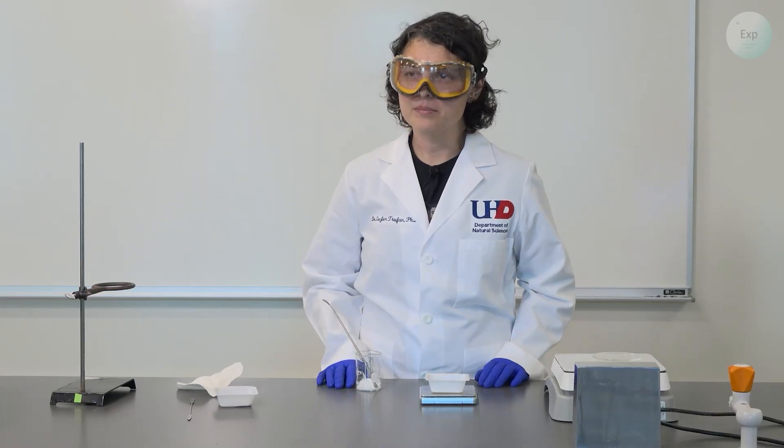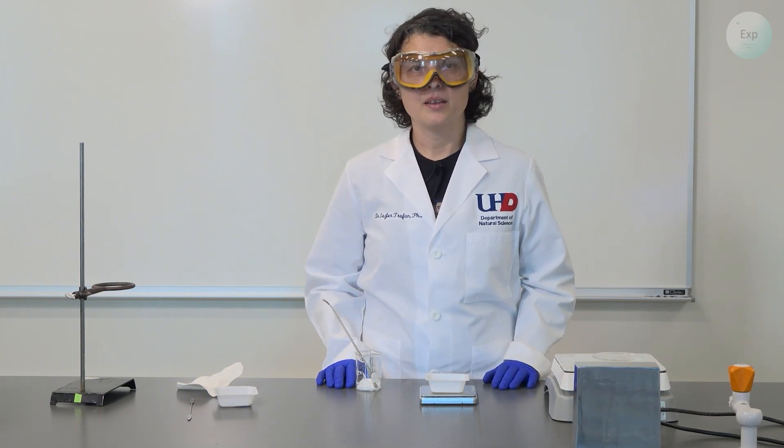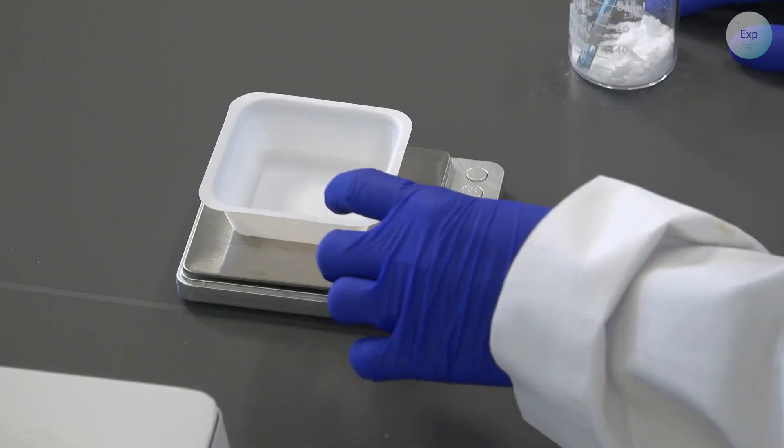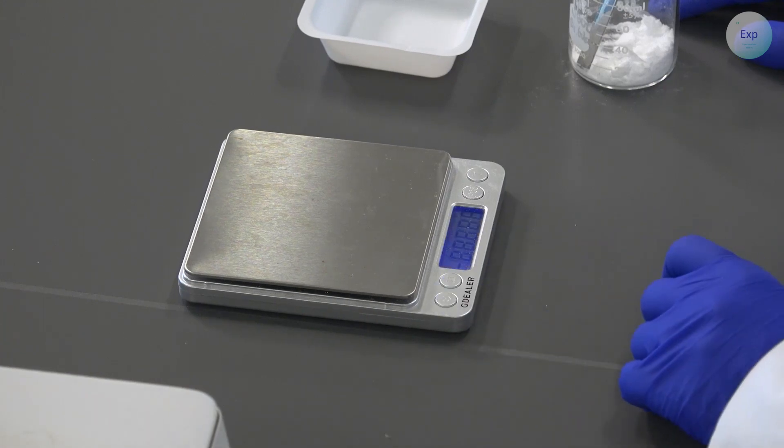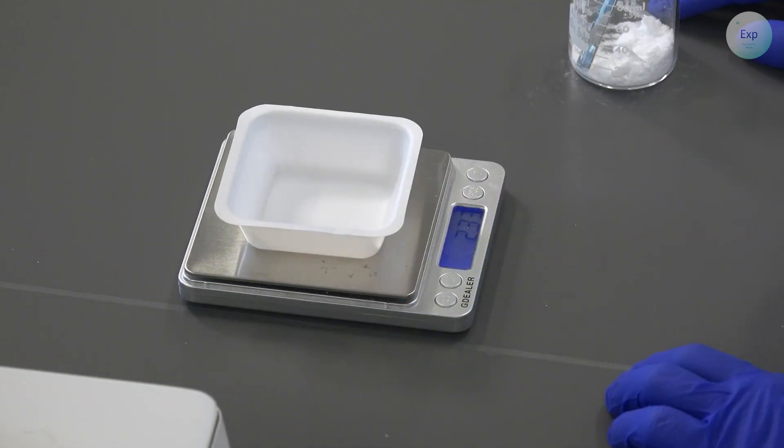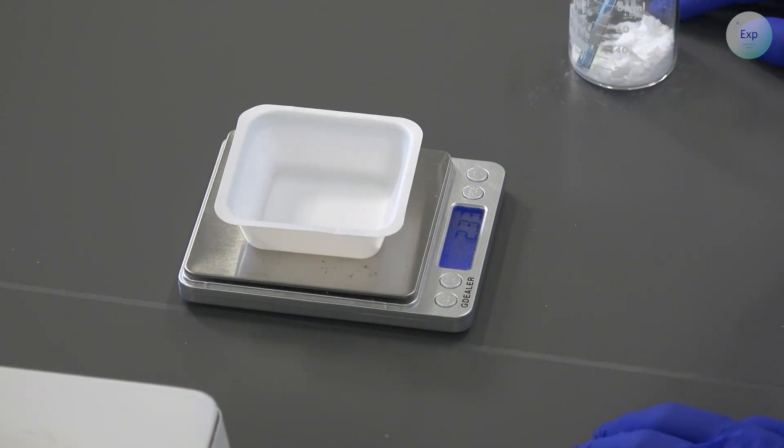The other thing that you may be mindful of is if it takes too long to scrape, then sometimes your scale may turn off in the meantime. So in those instances, it may be better to remove your weighing boat, turn on your scale, tare it, place the weighing boat on top, record the mass of your weighing boat, and then even if your scale turns off, you will know the mass of your weighing boat. And then from the combined mass of the weighing boat with the salt, you can always capture the mass of the salt.